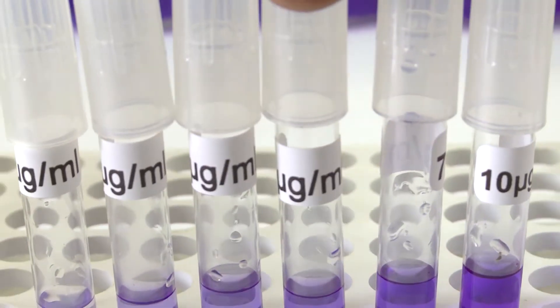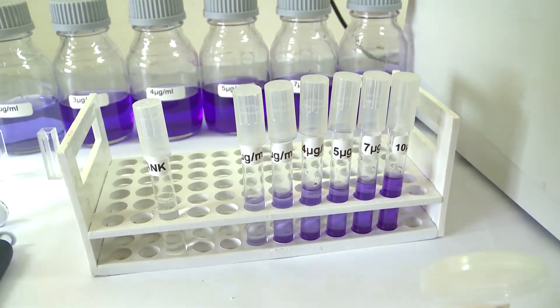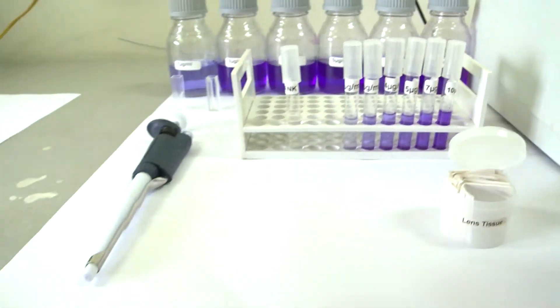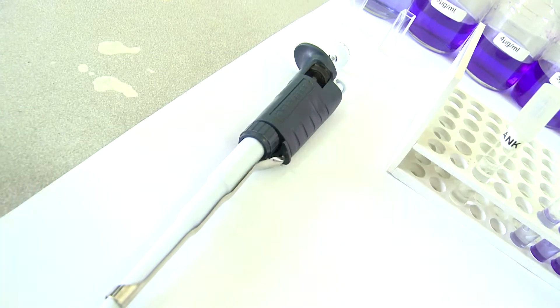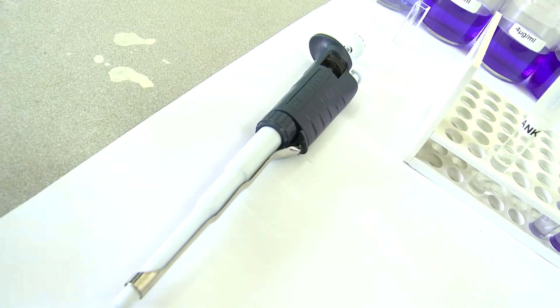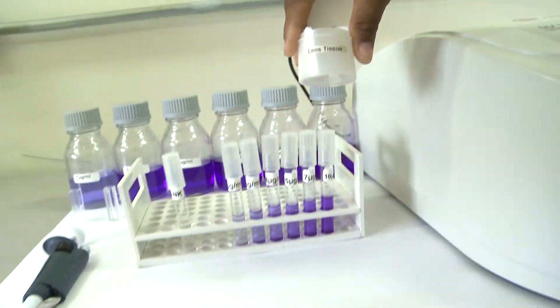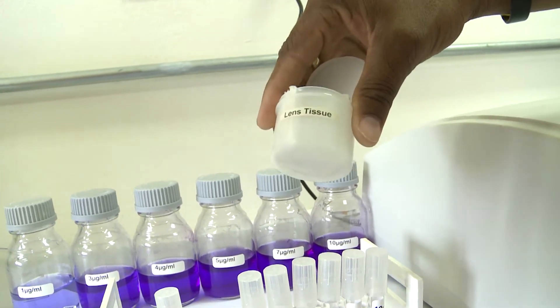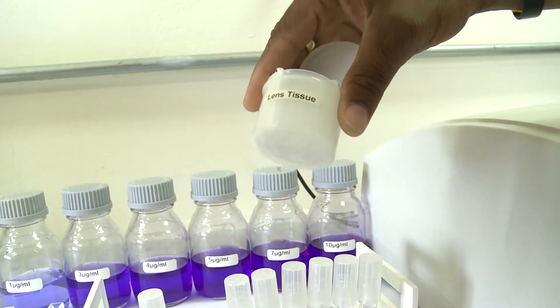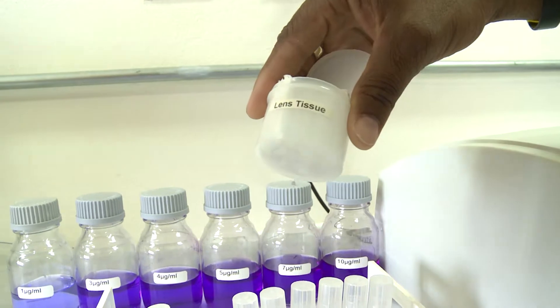Also, we have our assay tubes, which are small test tubes easily used in the laboratory. We also have our pipette. If you want to be precise about how much solvent or solution you add to your sample containers, you can use this as well. And last but not least, very important, we have our lens tissue — a very soft, non-abrasive tissue used to clean the cuvettes or assay tubes before placing them into the machine.